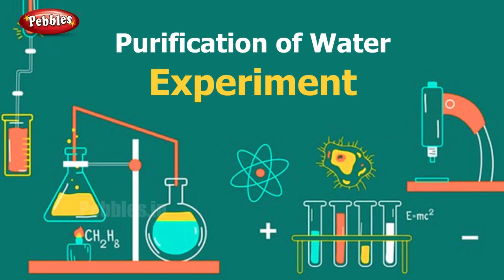In the next experiment, I am going to show you the process of purification of water. The removal of all unwanted particles, for example, the dust particles from the water. So, we remove the dust particles from the water and make the unclean, that is the dirty water, into pure, clean water.